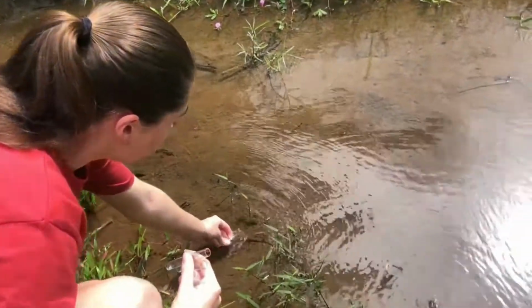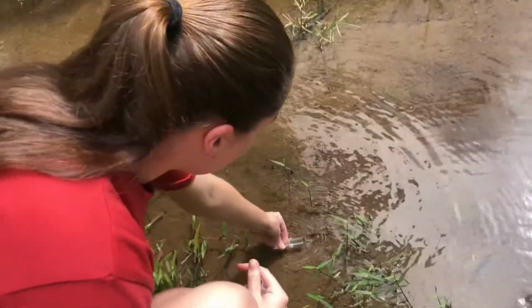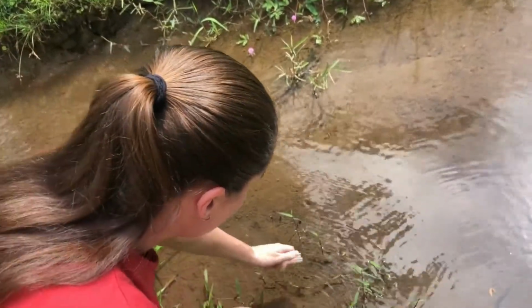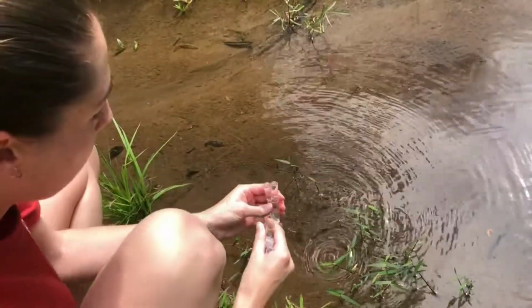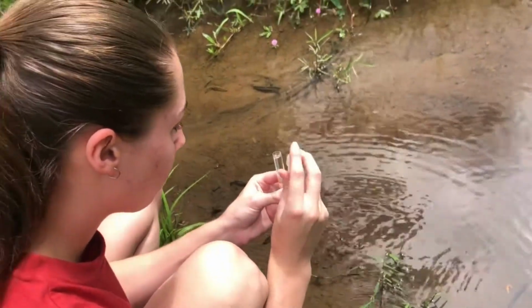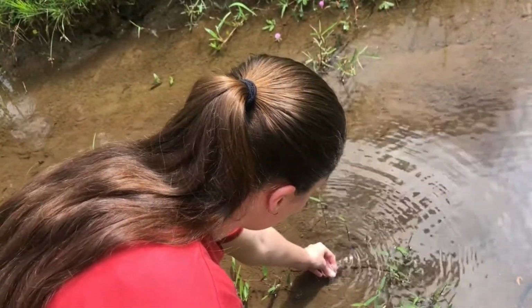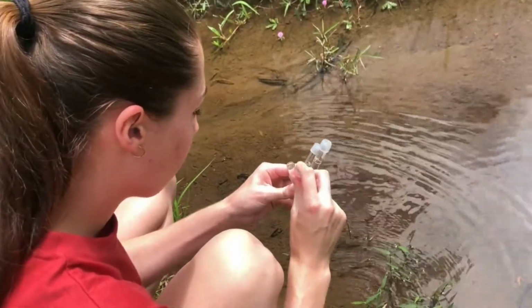First we have to rinse the test tubes a couple of times to make sure they're clean and won't affect the samples. We have 4 test tubes, one for each test. So we fill them all the way up and we put the caps on top. Making sure we get a full sample.